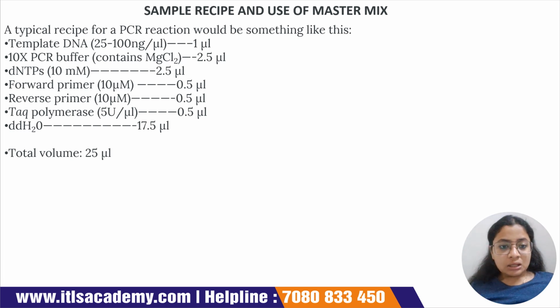Here we will firstly talk about the utility of the master mix, how we will prepare it, what the recipe of the master mix is, and what the components of the mix are, because master mix is a very important part of the PCR reaction. Why is it known as master mix? Master means something which regulates everything, and mix is also something that we know.